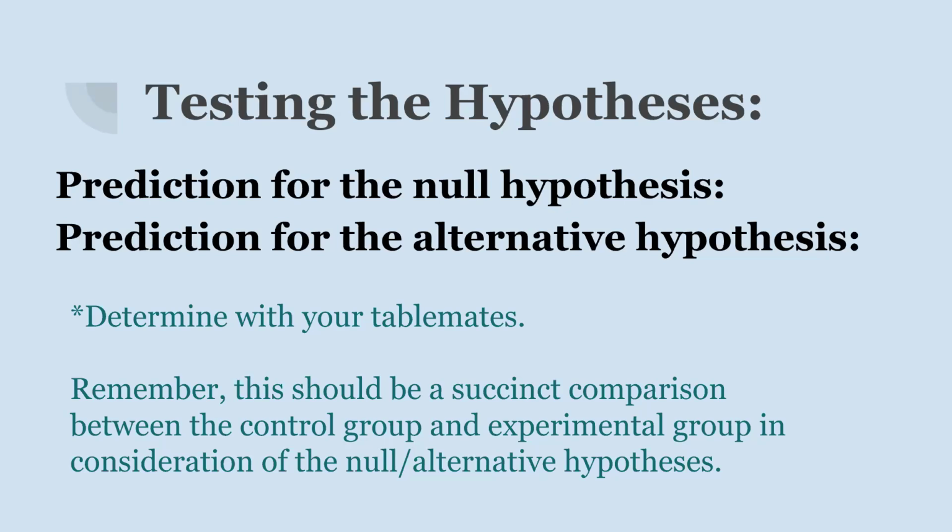With that heterozygous banding. So one thing that you could say is kind of roughly the prediction for the null hypothesis: you could state that there is no apparent banding present at the 250 base pair sequence in the instructor sample as compared to the control group, which has banding at 250 and 300 base pairs.